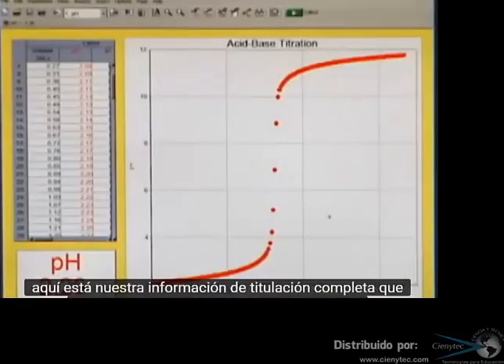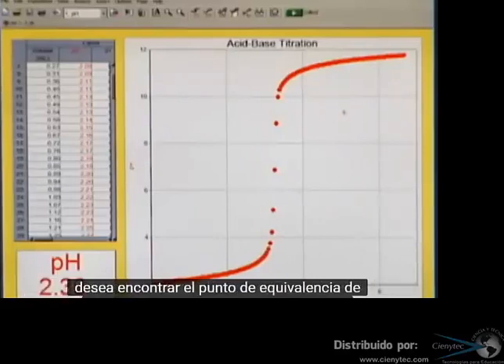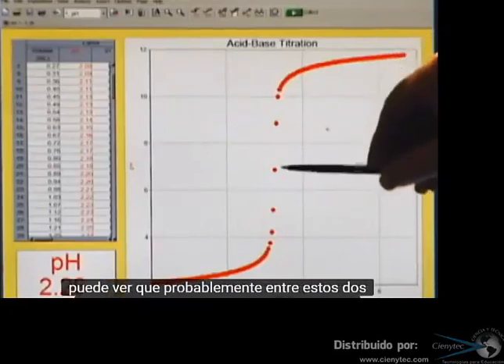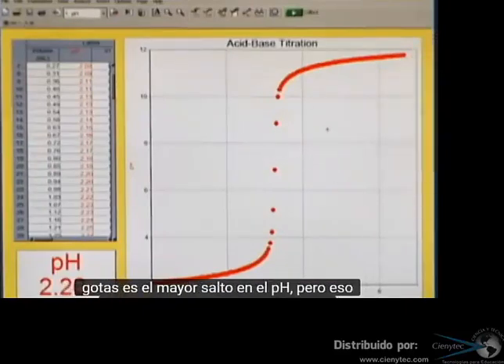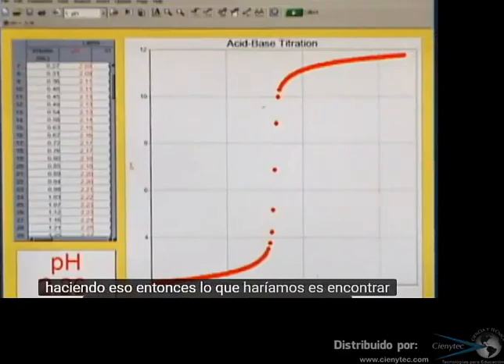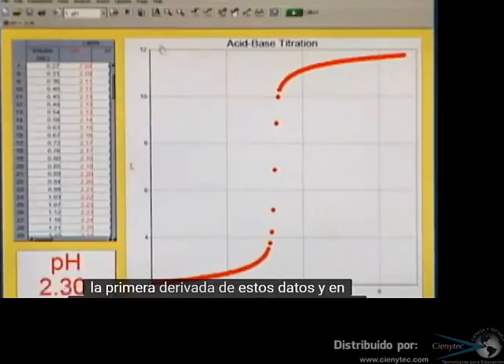We want to find the equivalence point of this. So if you look at this pH data, you can see that probably between these 2 drops is the largest jump in pH, but that doesn't give us a very accurate reading doing that. So what we would do is find the first derivative of this data, and in the Logger Pro file we've already done that for you on page 2.